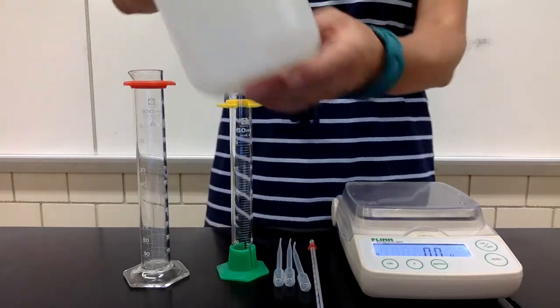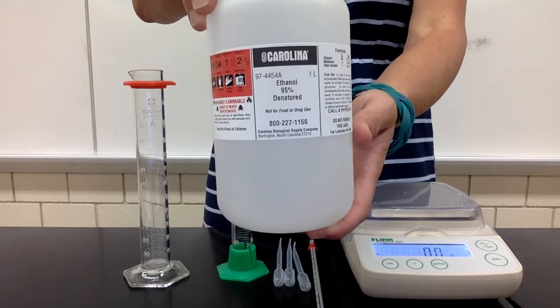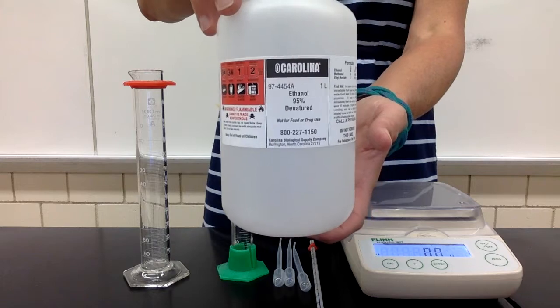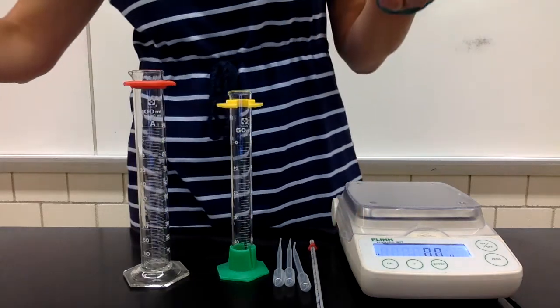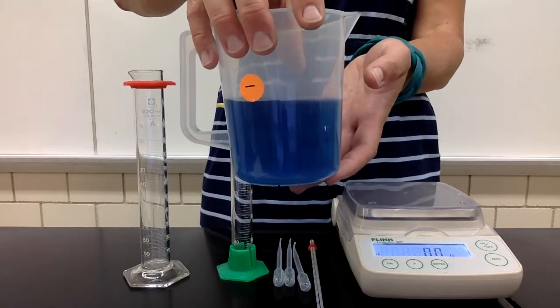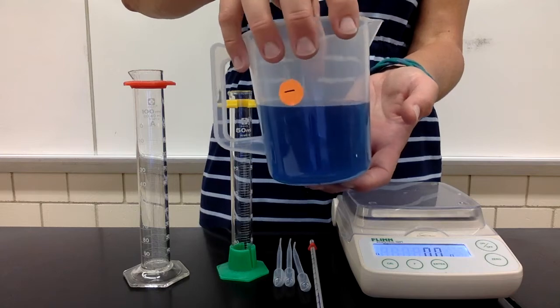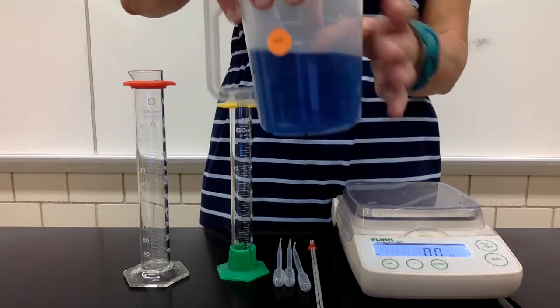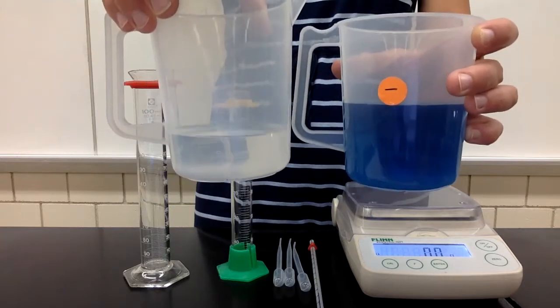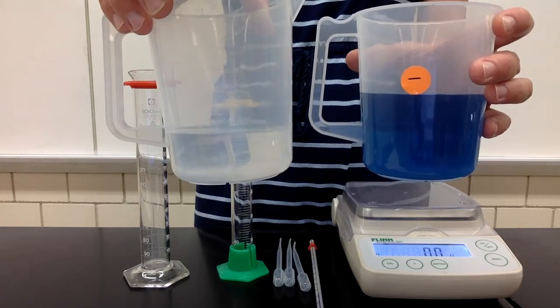The chemicals we are going to use are ethanol, which is a type of alcohol. It is flammable and it is toxic, and you don't want to get it in your eyes. And some deionized water, which has been filtered. That's what it means to be deionized. So it's pure water, but it has a little bit of food dye in it because ethanol and water are both clear liquids, so we needed some way to distinguish between them. The water is dyed blue and the ethanol is clear.